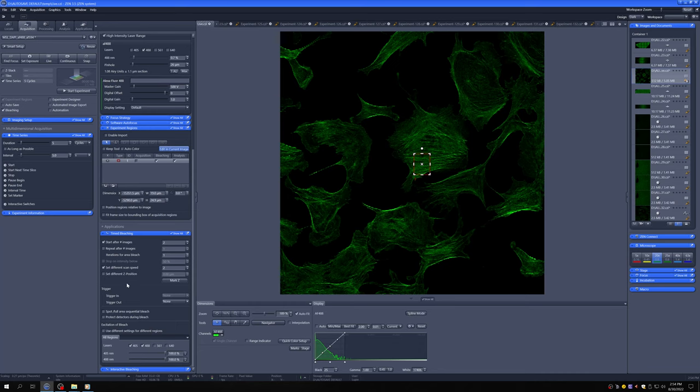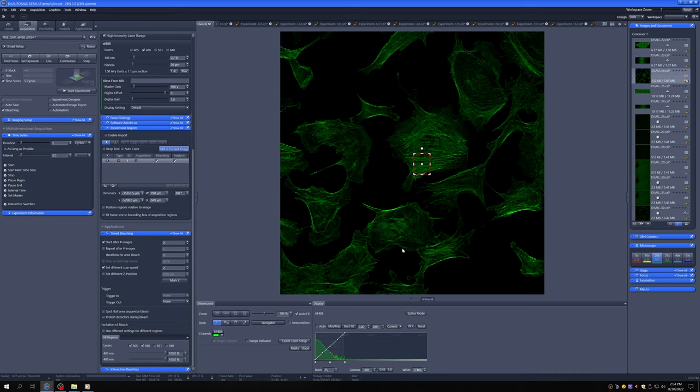You can set it to stop at a certain intensity. You can bleach multiple times. There's various things that you can work on here to get the bleaching so that you drop the intensity by the amount that you want in a time that makes sense for the process that you're studying. So there's a lot of stuff that you have to do to optimize, but the basic tools are here.